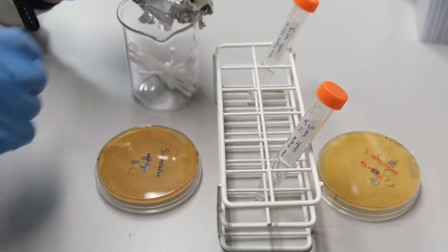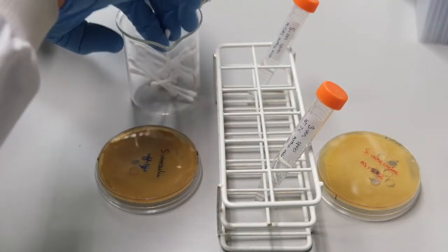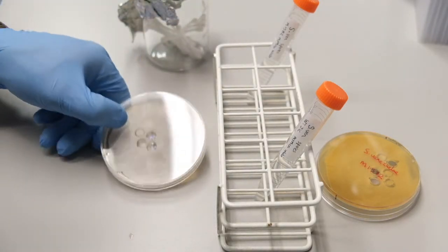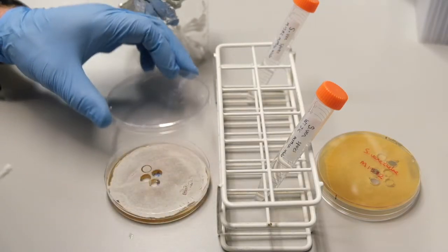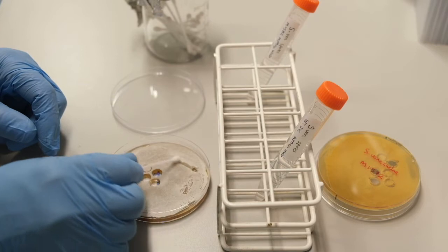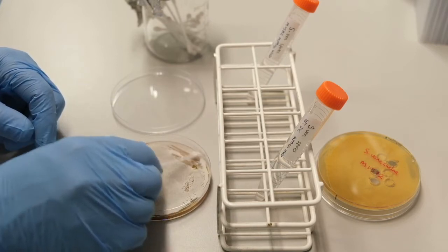We collect the spores by rubbing across the surface of the plate with a sterile cotton bud. We start with wild type Streptomyces venezuelae, collecting spores from across the entire surface of the plate.